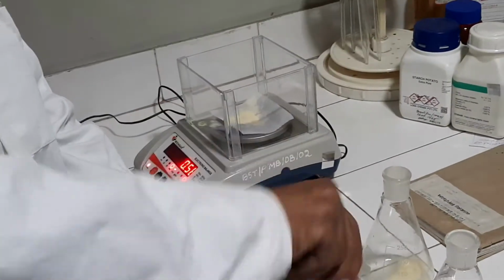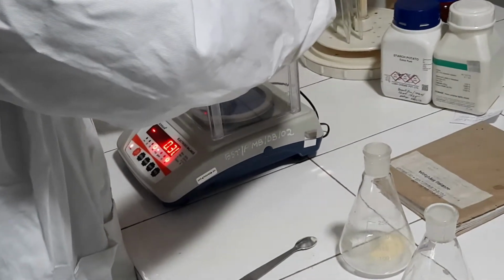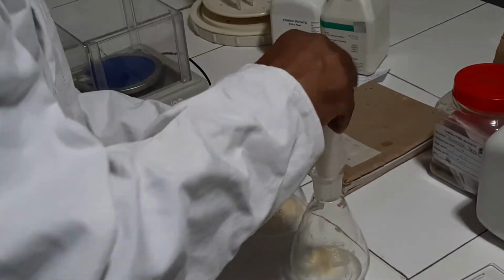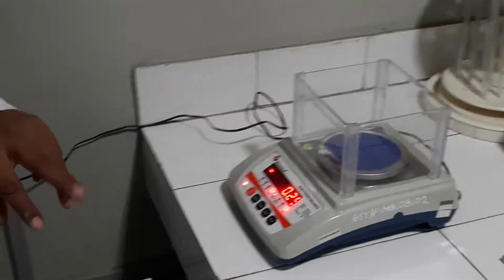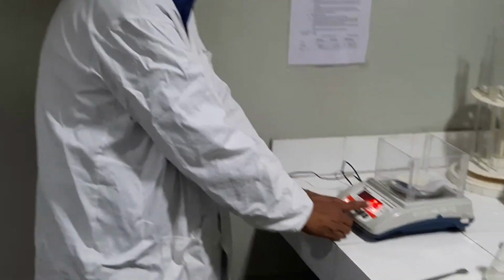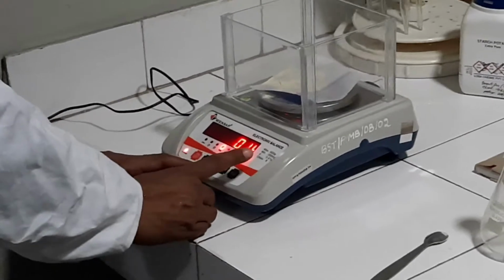I should say one thing to you: you see it is already sticking to the paper, due to its hygroscopic nature. When you weigh, the last digit on the right hand side should be overlooked.